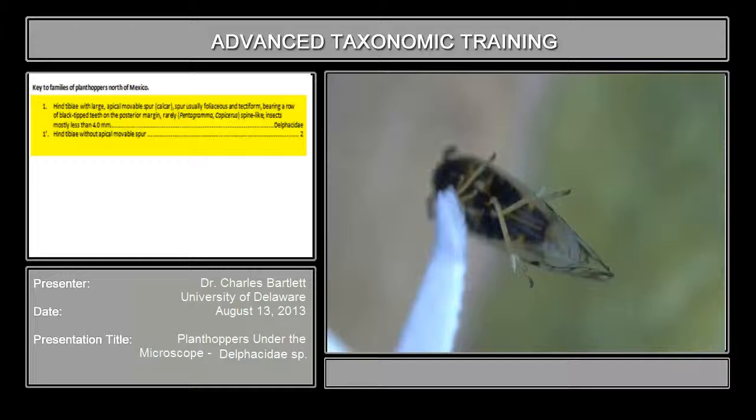And we see, sure enough, right here and right here — on the apex of the hind tibiae, there is a large movable spur.